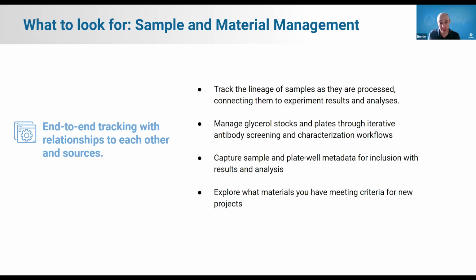Aligned with that example, I want to capture sample and plate well metadata for inclusion with results and analyses. As I'm progressing through these iterations, these screening and characterization rounds, how do I keep track of that information well? How do I do that properly?